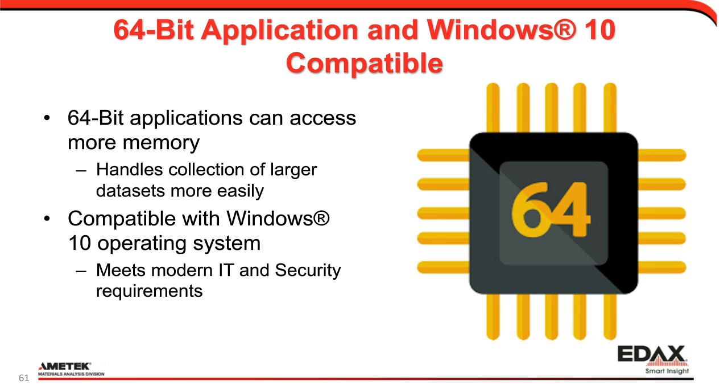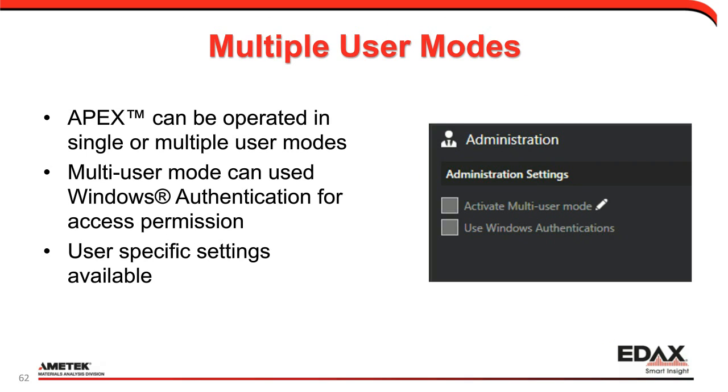We have multiple user modes. We know these are sometimes used in multi-user facilities. And so when we do this, we can have our own APEX-based login to control things, or we also have the option to use the Windows authentication. So if you have a specific domain login you use, we can piggyback off that to define the user. And then we can have user-specific settings.